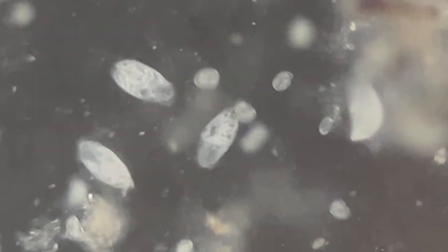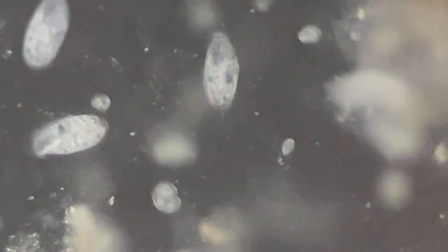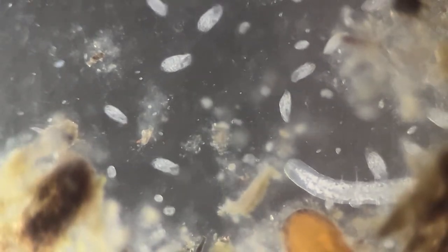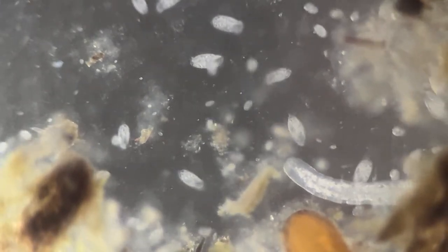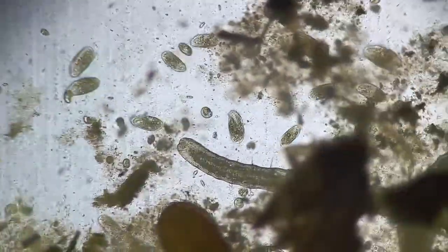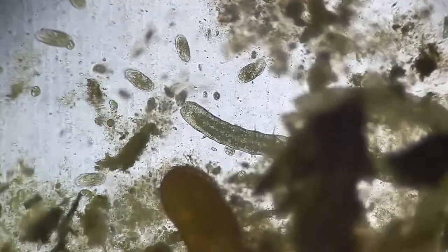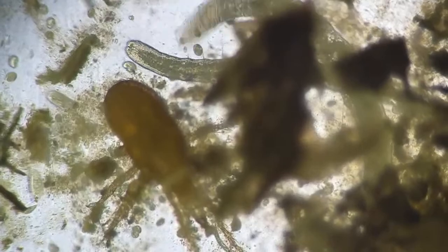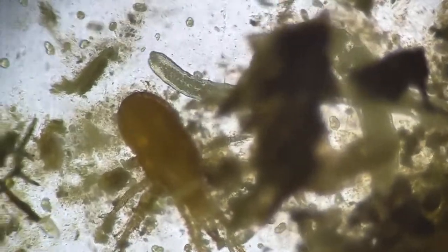Let's focus on these creatures. Look at them. How beautiful. Now, had it been the normal light, piercing light, it would have been black and white, sort of like this. This is the microscope's backlight, which does give me a brighter view, but it doesn't give me a very true color perspective.